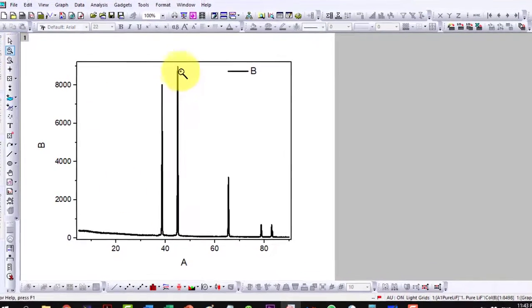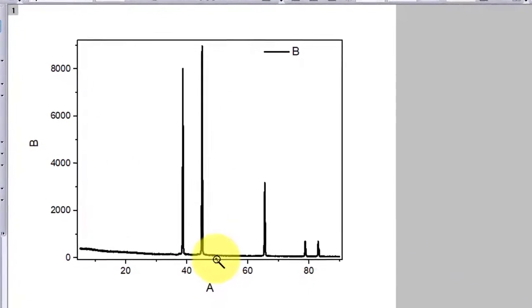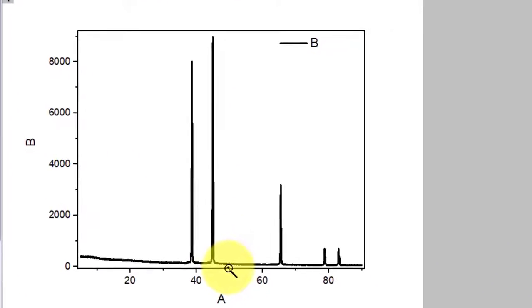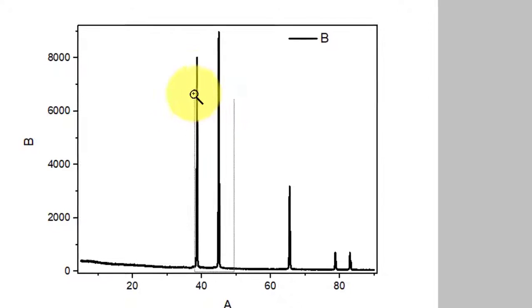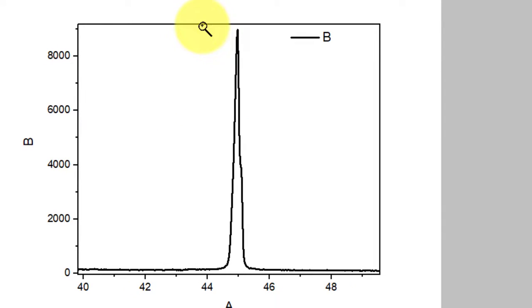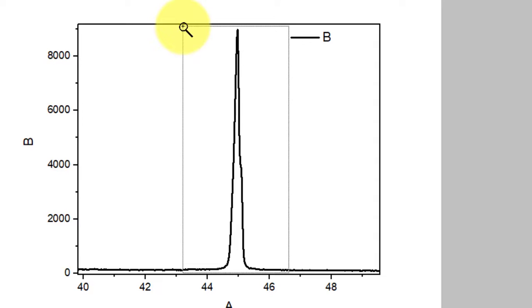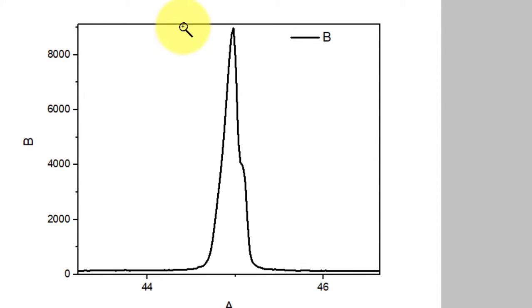I will focus on this one and let's say I do select this peak only and here it is. Let me maximize it a bit more and here is our peak.